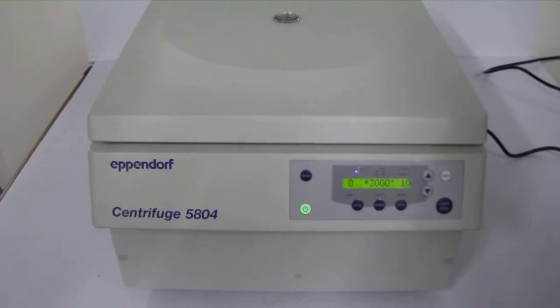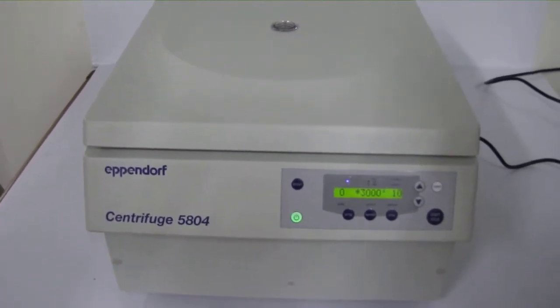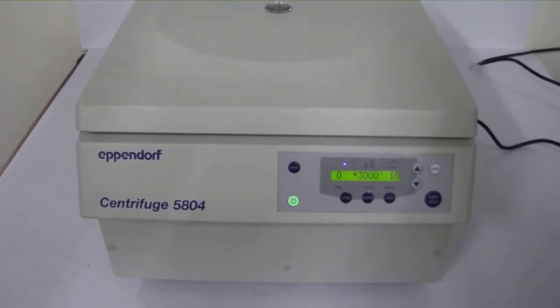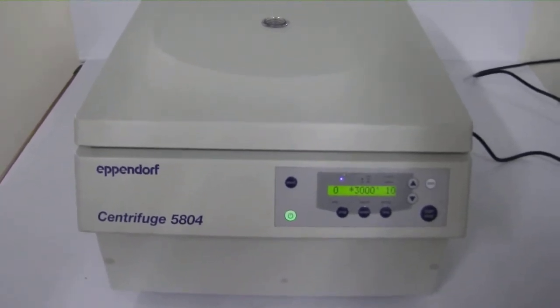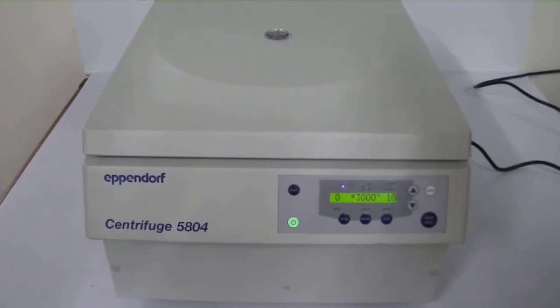Essentially, the Eppendorf 5804 is three centrifuges in one: a high-capacity centrifuge for cell culture and clinical applications, a high-speed centrifuge for separating cell lysates, and a micro-centrifuge for nucleic acid purification.